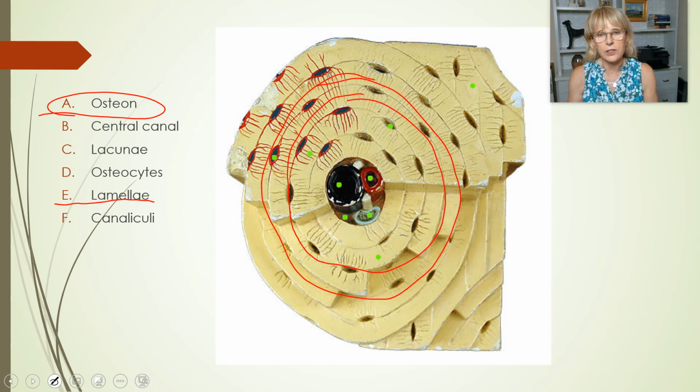The reason there are osteons is that bone tissue has a really large amount of this calcium phosphorus soaked matrix that is very hard, and oxygen and glucose need to get from the little artery here all the way out to that cell out there.